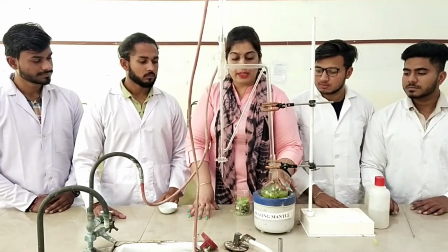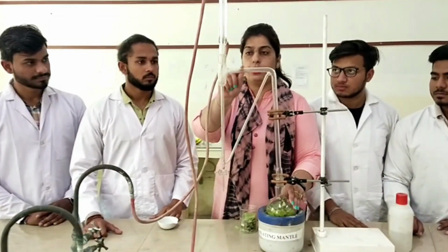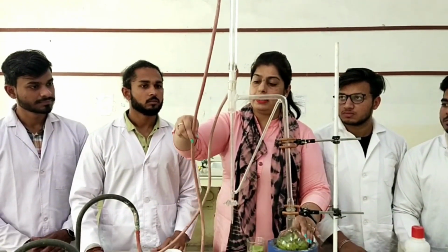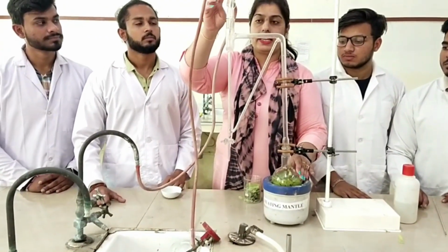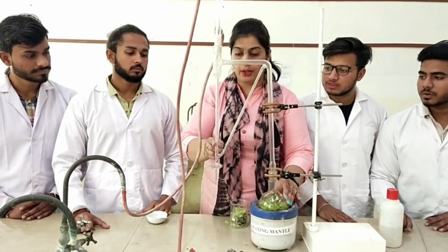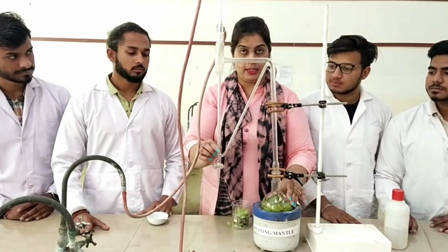The oil from the eucalyptus leaves goes up with the steam and goes from here with the help of the condenser. In the condenser, this is the inlet of the water and this pipe is the outlet of the water. The steam will condense and be converted into water. The steam also has the content of volatile oil, right? So here the volatile oil will be accumulated.